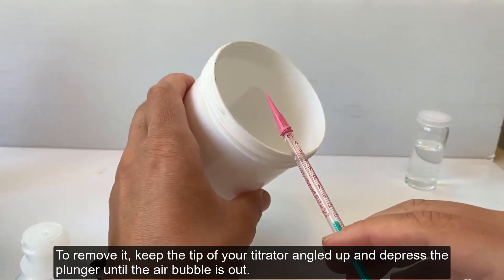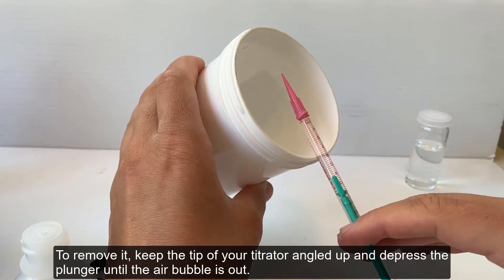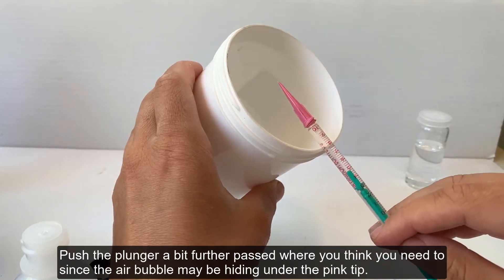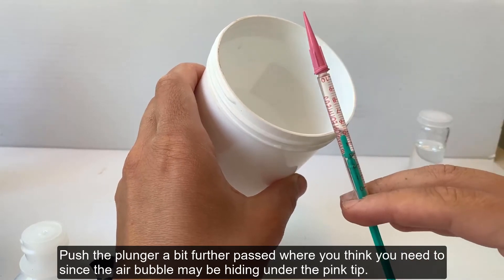To remove it, keep the tip of your titrator angled up and depress the plunger until the air bubble is out. Push the plunger a bit further past where you think you need to, since the air bubble may be hiding under the pink tip.